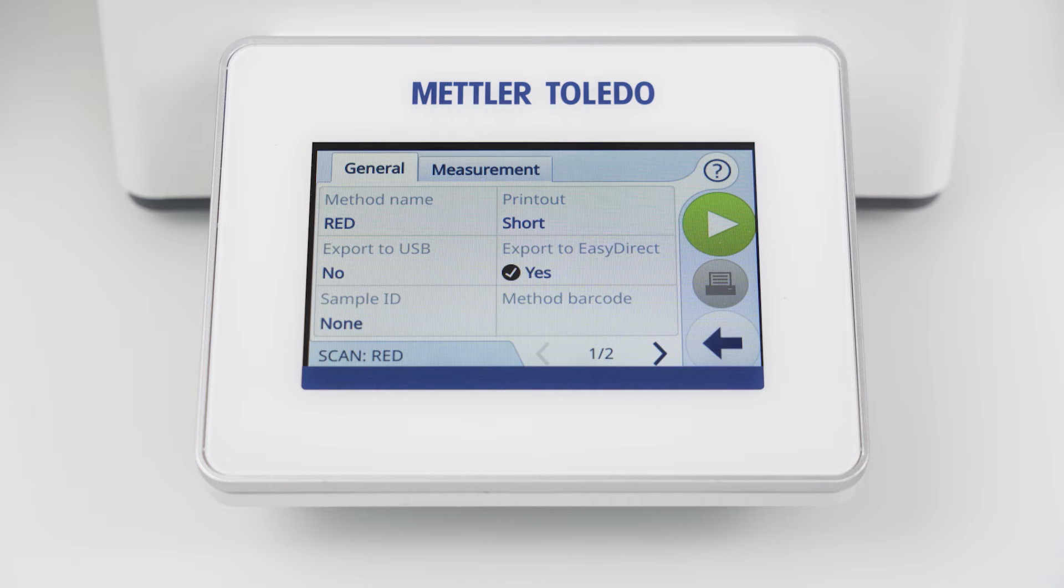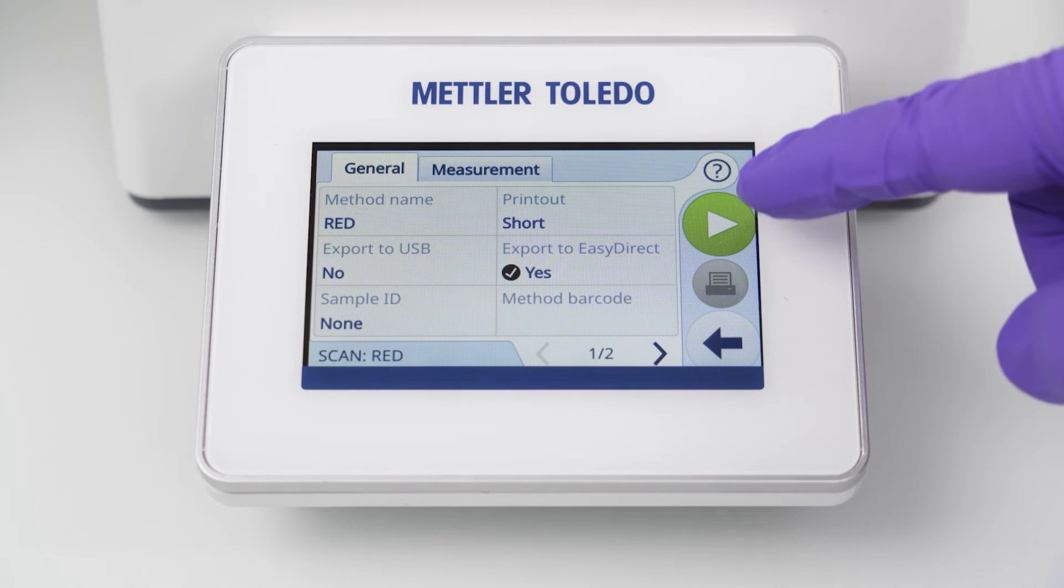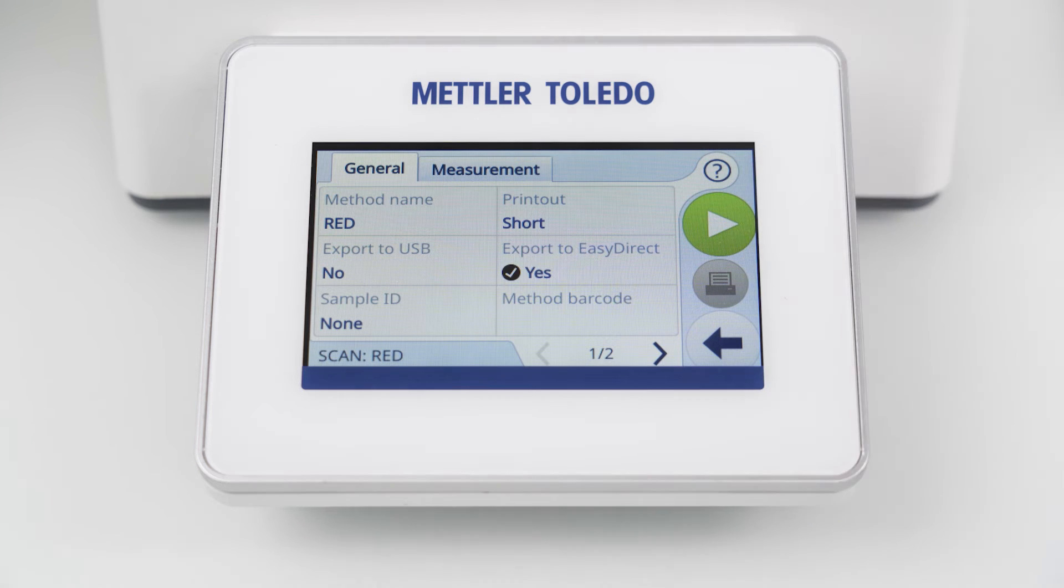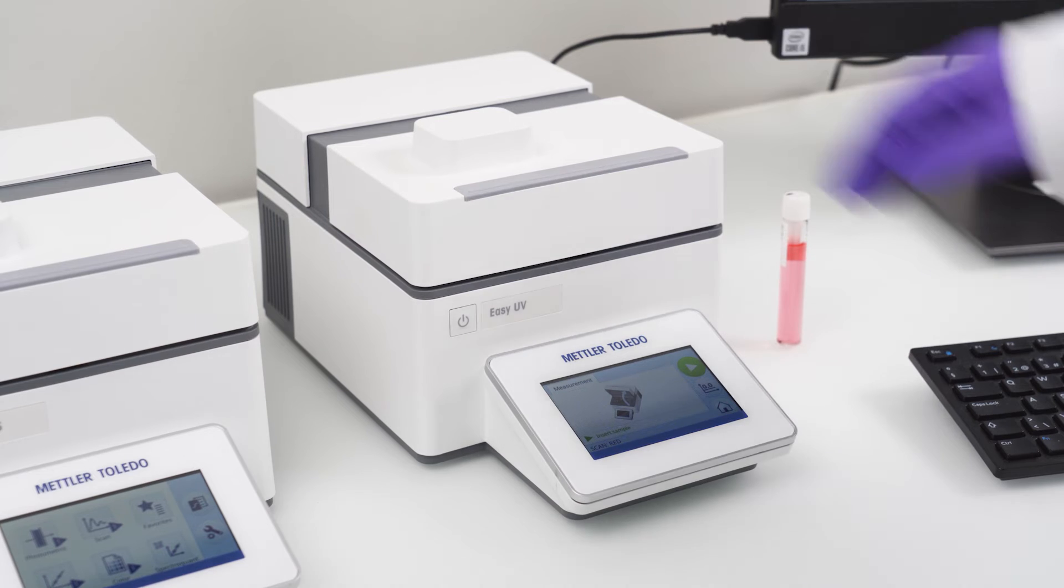As soon as you execute a method the result will be transmitted automatically into the EZ Direct database. With a simple scan measurement I want to show you how quick the transmission is and what you can do with the data afterwards. Here I have prepared a scan method with the enabled method parameter export to EZ Direct.